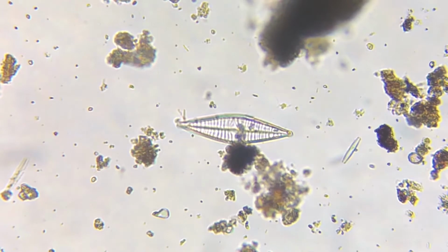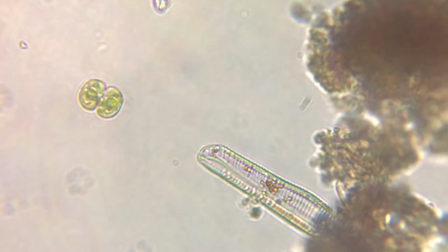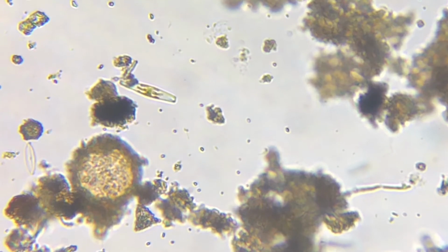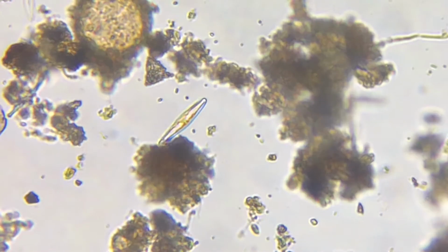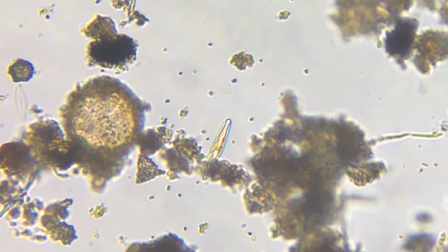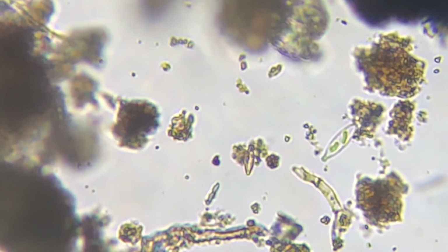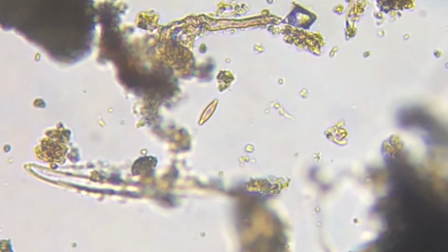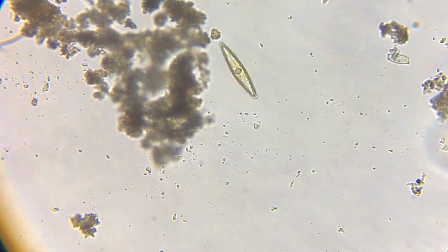Diatoms are characterized by their silica cell walls. They vary in shape and size, but due to their silica cell, are easily recognizable. They create their glass capsules using silicon dioxide and become almost indestructible. Silica is resistant to decay, and because of this unique quality, diatoms have been found in fossils as far back as the Jurassic period. This cell wall is also a reason why diatoms can be found in a vast majority of aquatic environments. They have been found living in ice and are some of the first eukaryotes to be discovered in hot springs. But why are diatoms so important they get their own video?